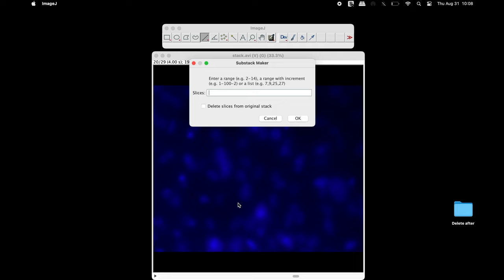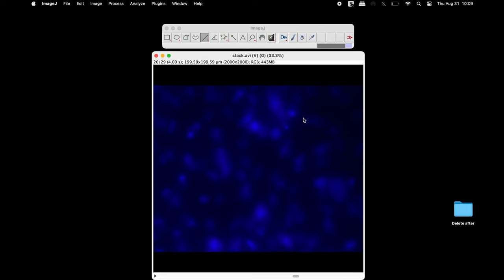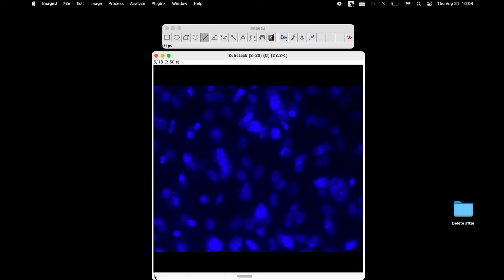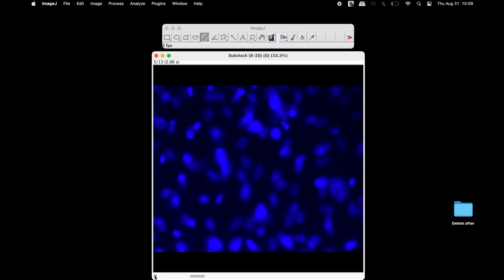In the Substack Maker window, input the start and end slices of interest and then click OK. The new stacked image contains only 13 slices.